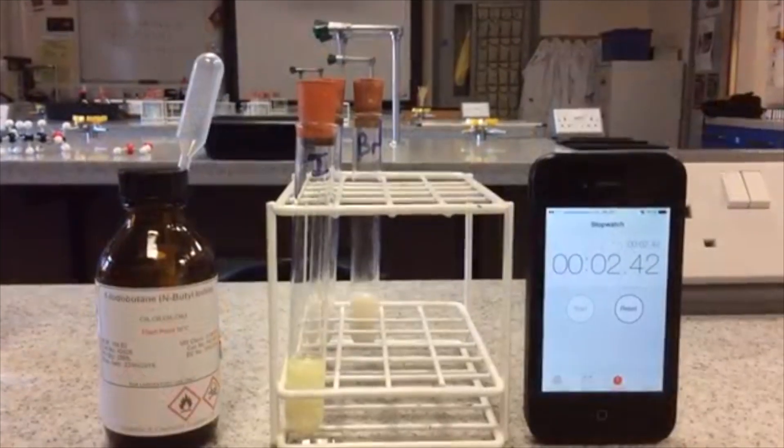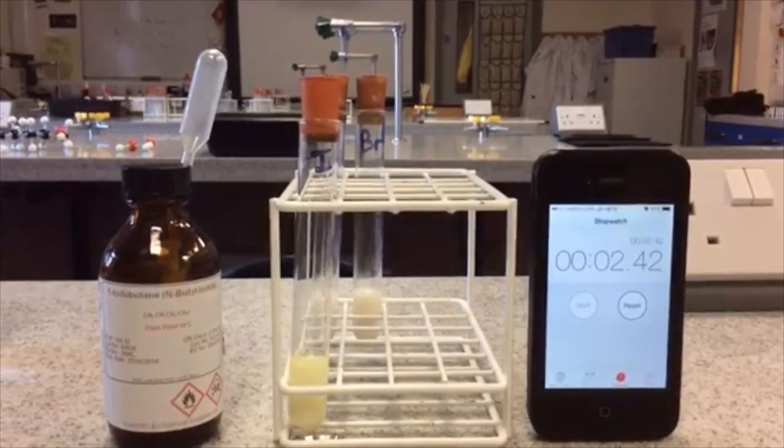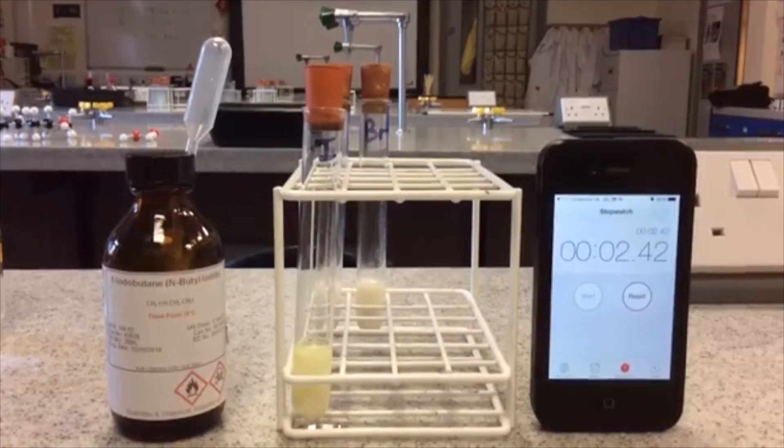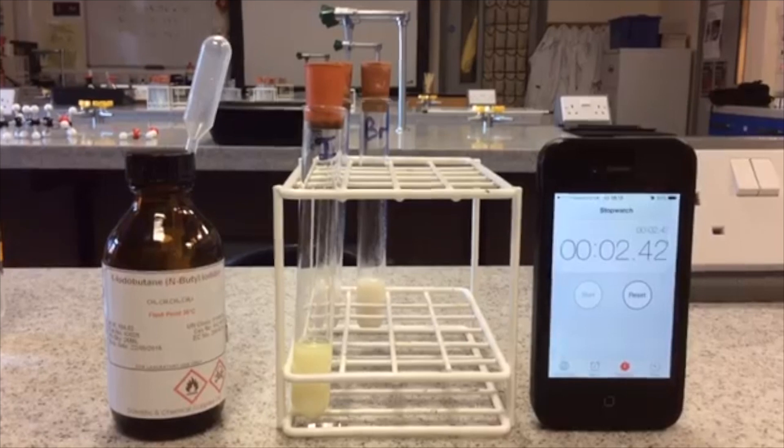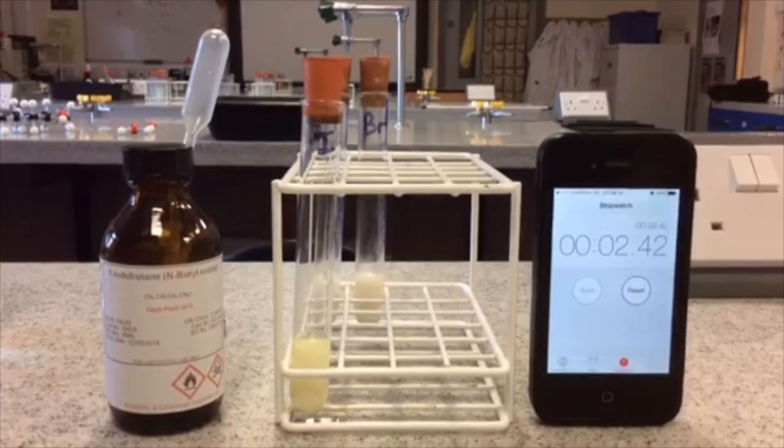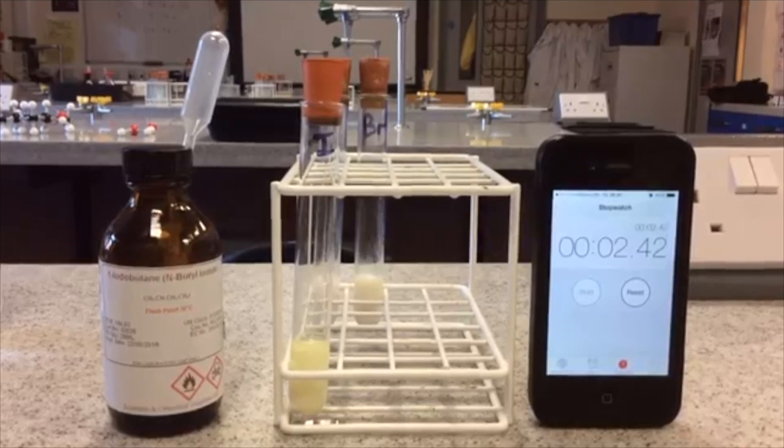Finally, we have the yellow precipitate of silver iodide, formed from the hydrolysis of iodobutane, and that's taken a really short amount of time: 2.42 seconds.